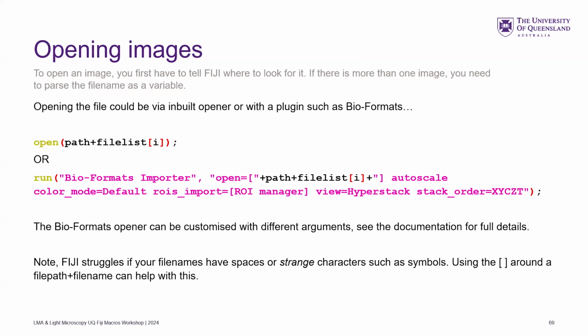Whether they're resolution pyramids or, if it's like a Leica, you tend to have multiple files stored in the lif file. So you may need to tell it open all, there's a series underscore all, or series 1, or you open all of them and then search for a window called series 0. That's how you approach it.